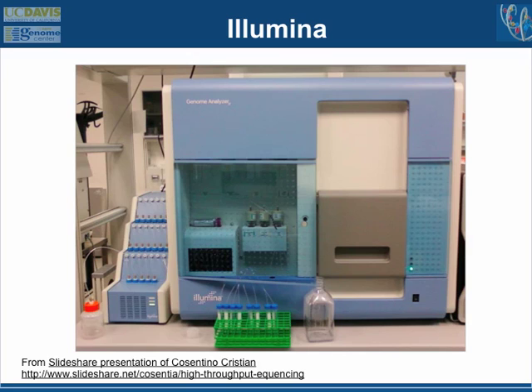So again, the Illumina and ABI Solid methods are the same principle. The details are very different, but the principle is completely identical. Make a lot of copies in physical isolation of your non-cloned piece of DNA and then run some sequencing reaction.